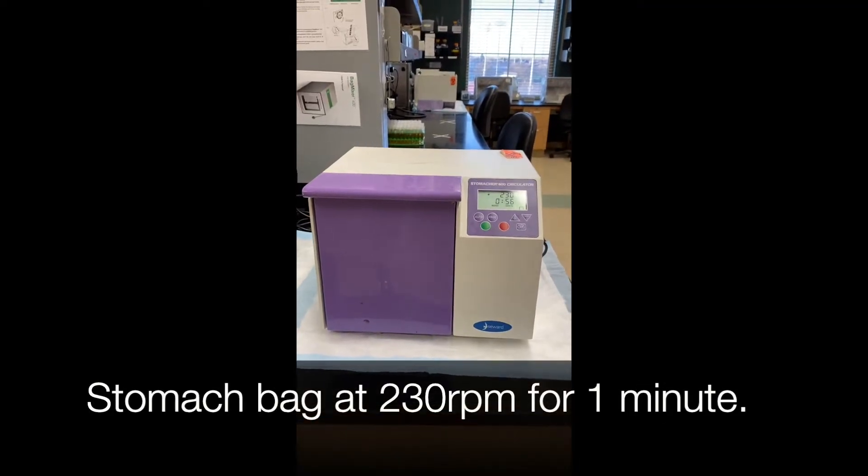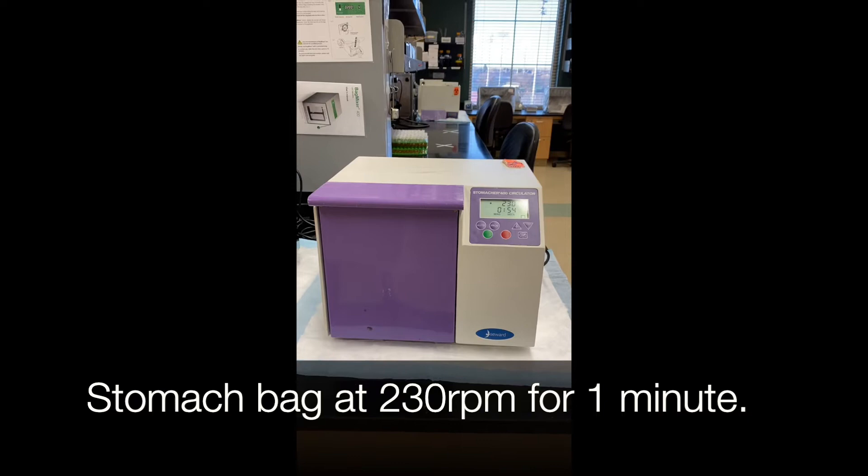Stomach your enrichment bag at 230 rpm for one minute. Incubate your sample at 37 degrees Celsius for 24 hours.